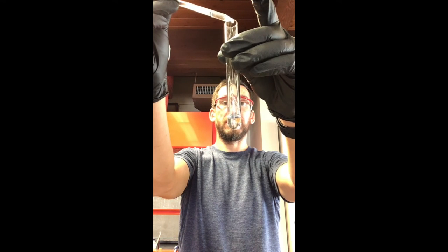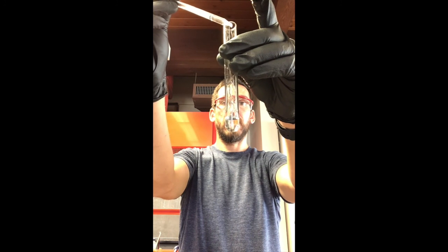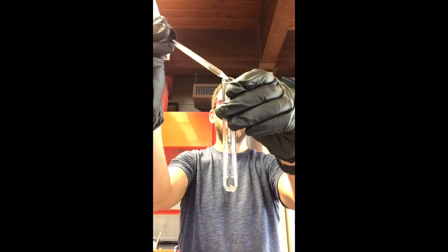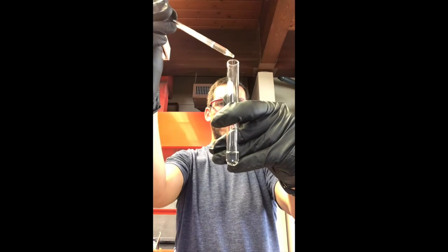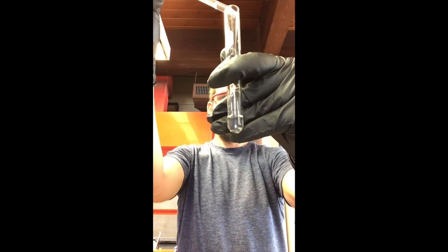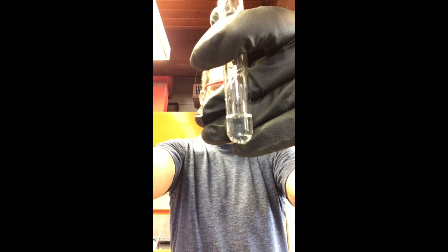So I want to add it slowly, just to see what happens. You can kind of see something happening, right? Let's see if that helps with the contrast. There's just something happening, right?